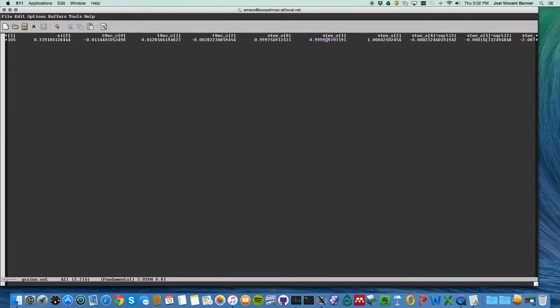The next 6 columns are V inverse, 0, 1, 2, and then these, this should be 3, 4, 5 instead of 4, 5, 6. But in the headers, these are the inverse stretch tensor components in the 6-vector notation that I use internally.